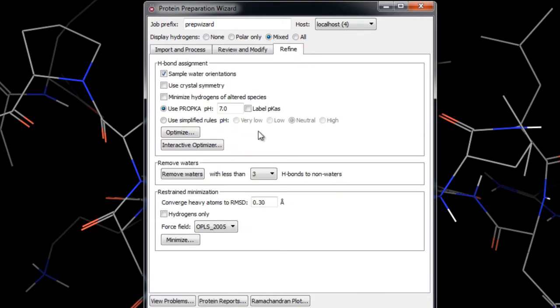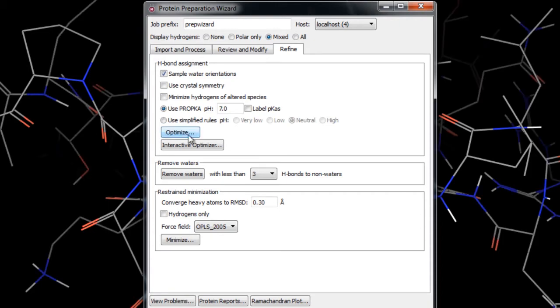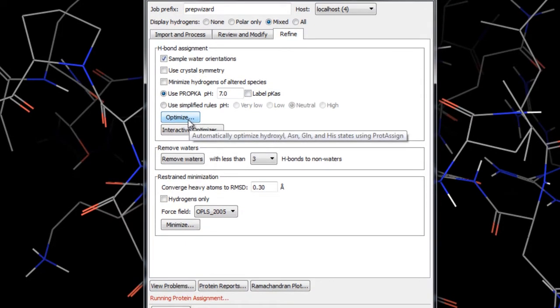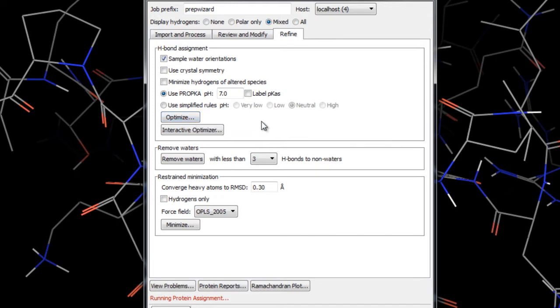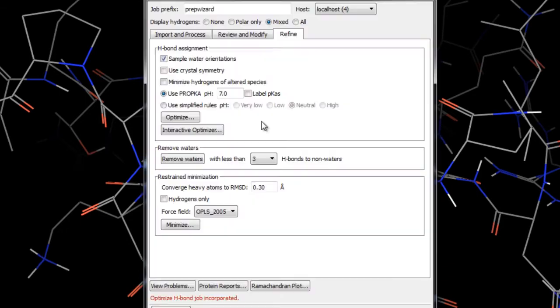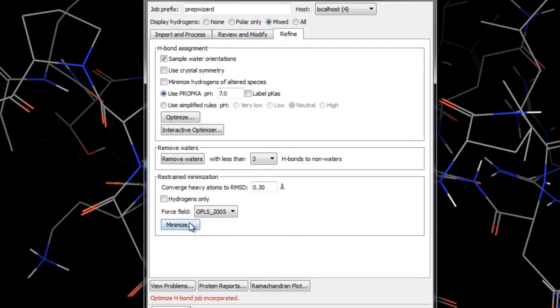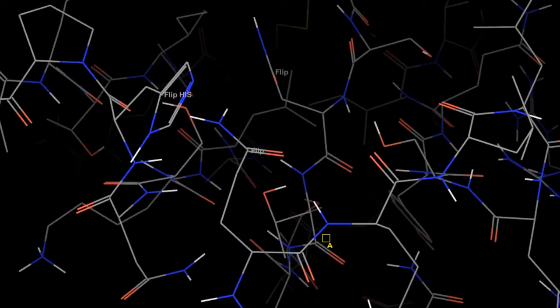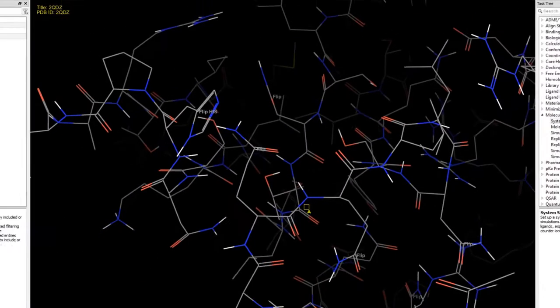Here we'll click optimize in the H-Bond assignment section. Optimizing the hydrogen bonding is important because x-ray structures do not usually have enough resolution to fix the orientation of terminal amides or histidines or the orientation of hydroxyls and thiols. Once that's done we'll click minimize. Here a restrained minimization is performed which removes the atom clashes and relaxes the sidechains and other modifications made to the protein.